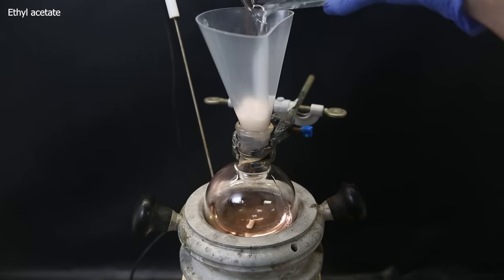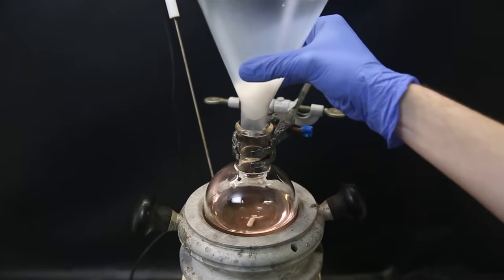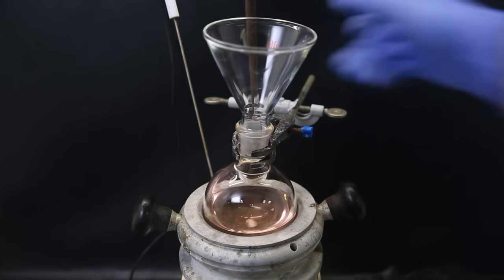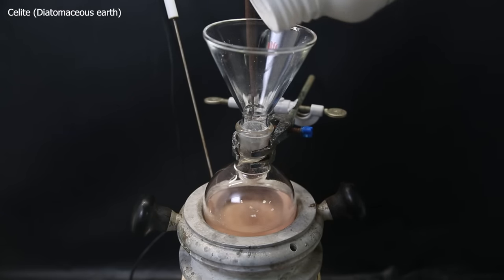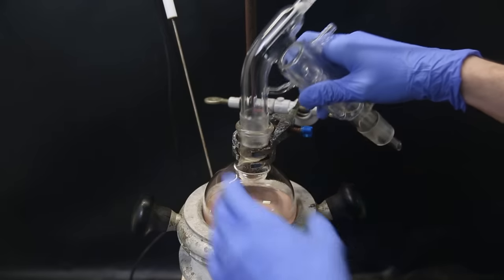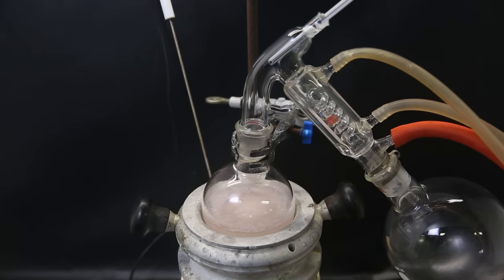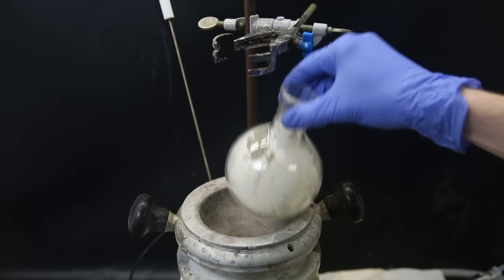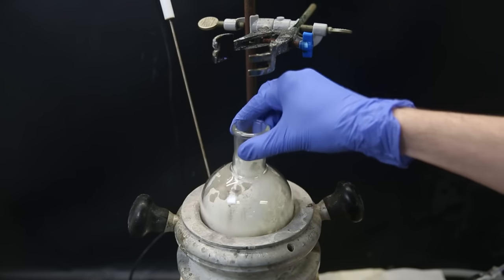I also wash it down with a bit more ethyl acetate. I then attach a funnel, and like the first synthesis, I add some Celite to the solution to get a powder that is easily handled. I then distill off all of the solvent, and I am left with a dry powder that contains the product. The powder comes loose easily, and I just scraped it with a spatula to get it all down.